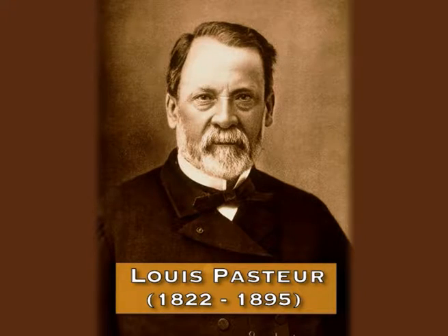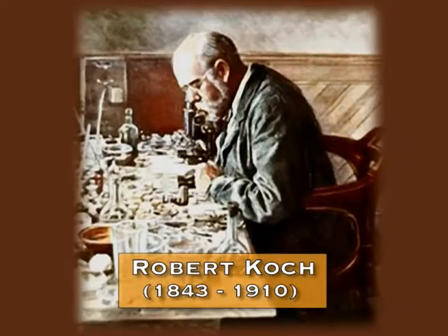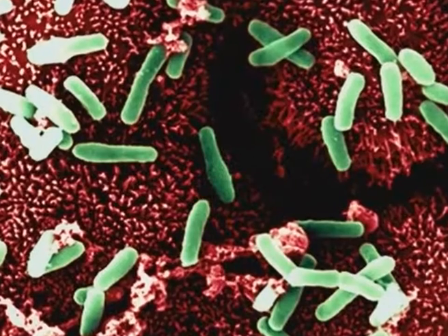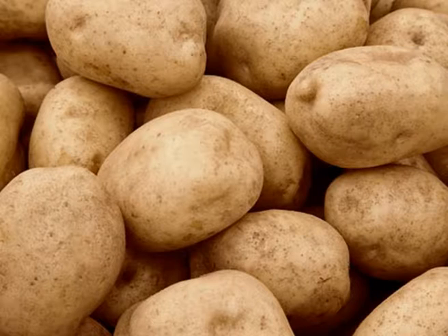The history of the bacteriological medium dates back to the time of Louis Pasteur. He was the first person who devised liquid cultures made up of urine and meat extract to study the pathogenic group of bacteria. It was then followed by Robert Koch. He was a pioneer of Koch's postulates, and he was studying various pathogenic bacteria causing harmful diseases in human beings. He understood the importance of solid medium, and that's why he took up potato as a base for producing solid medium.